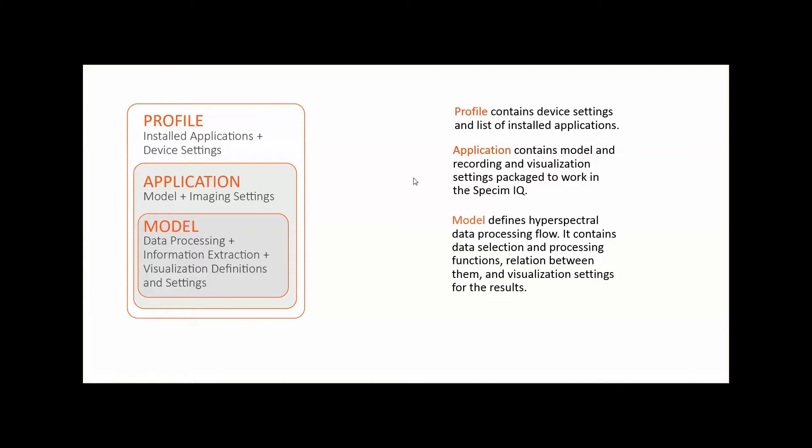The ready applications are then included as a part of a profile, which is then installed to the Specim iQ. A profile can contain one or more applications as well as various device settings, such as the timeout setting for power saving. You can save multiple profiles in the Specim iQ Studio and quickly load a profile into any Specim iQ camera.